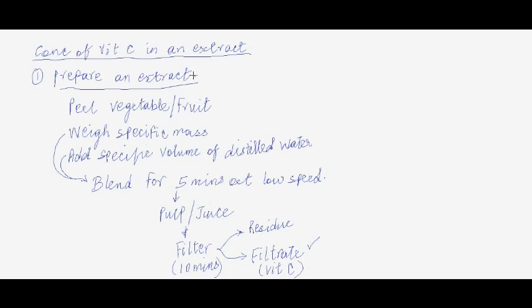And if you see, during this we've standardized or controlled certain variables. For example, we've taken a specific mass of the tissue, we've taken a specific volume. We've also blended both of these for a specific period of time. Even the speed is mentioned. You filter for a specific period of time, variable.